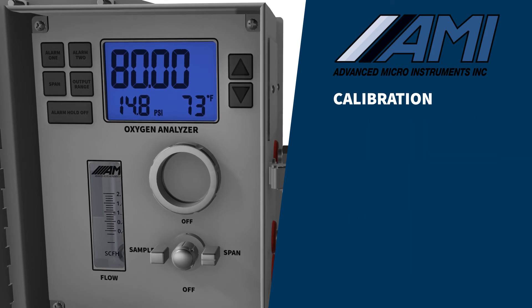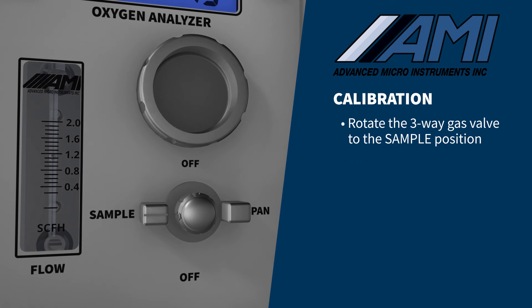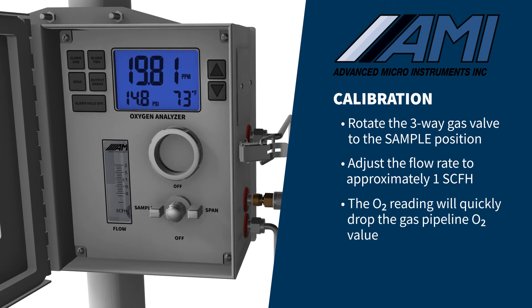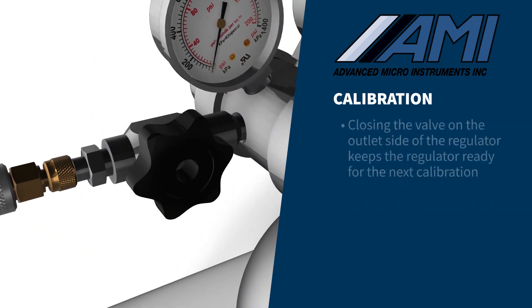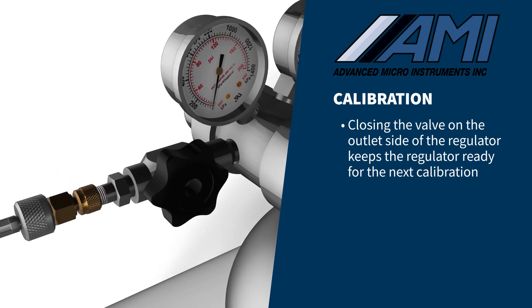Your calibration is now complete. Rotate the three-way gas valve to the sample position and adjust the flow rate to approximately one SCFH. The oxygen reading will quickly drop to the gas pipeline oxygen value. Be sure to close the valve on the outlet side of the regulator to keep the regulator ready for the next calibration without needing to repeat the block and bleed.